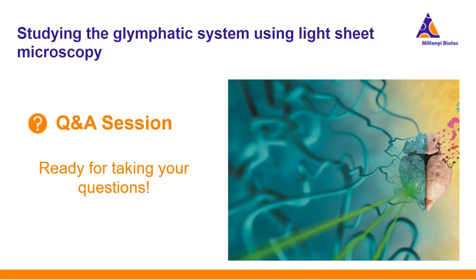We haven't tried it yet, but due to this issue with the loss of fluorescence in our EGFP reporter mouse, we may actually try that, but we haven't tried it yet.